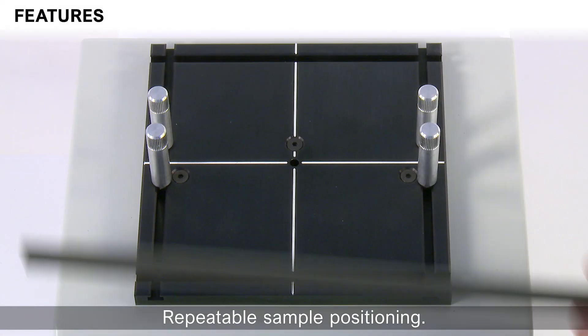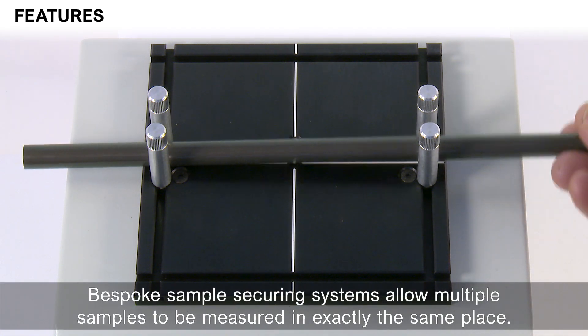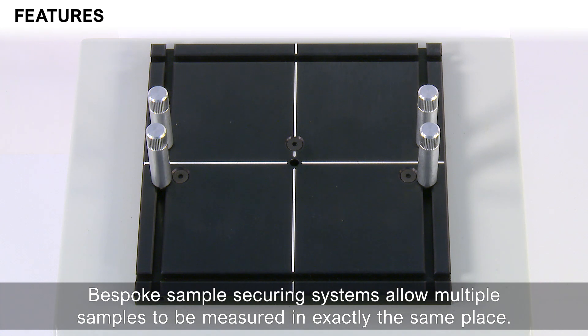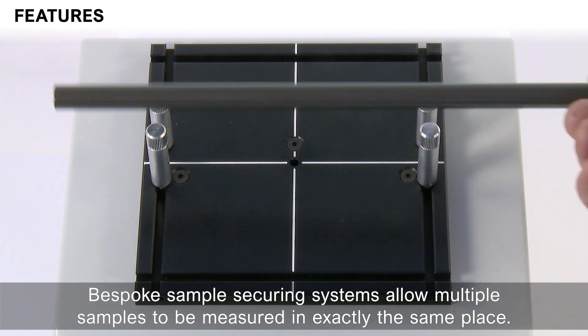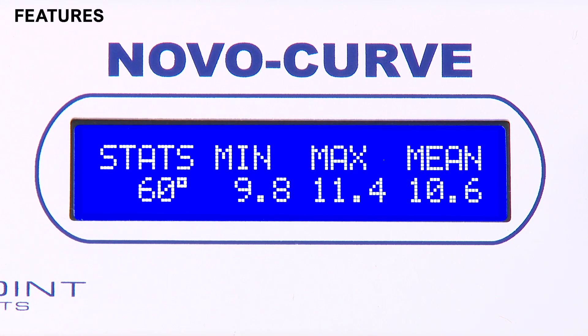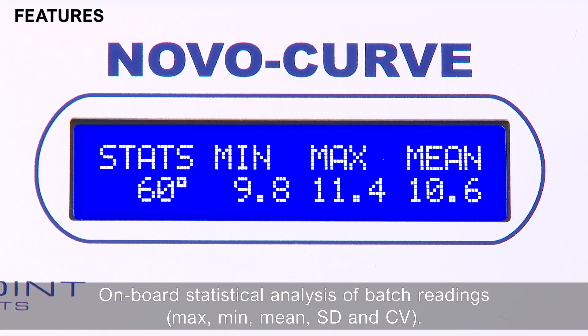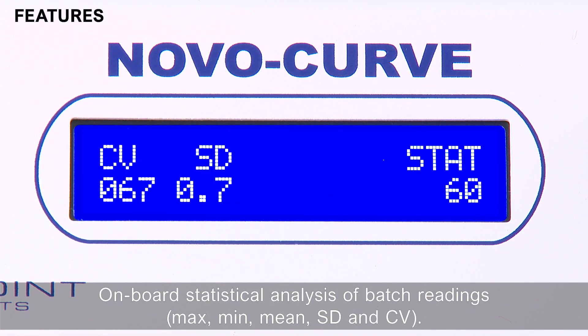Repeatable sample positioning. Bespoke sample securing systems allow multiple samples to be measured in exactly the same place. Statistical analysis of results: batch readings, maximum, minimum, mean, and standard deviation.